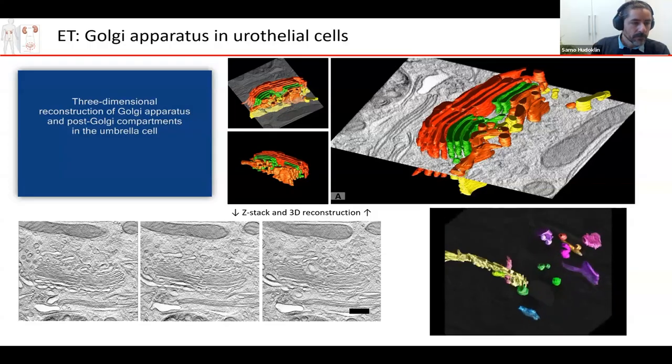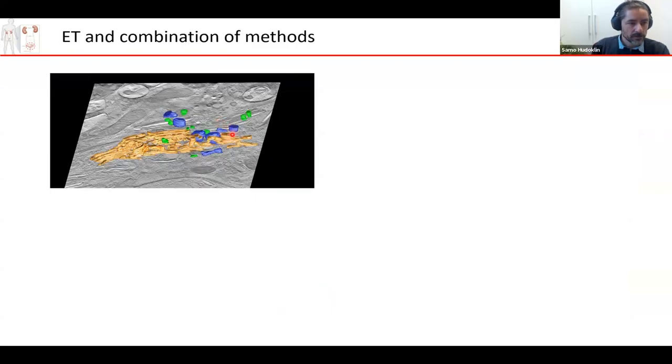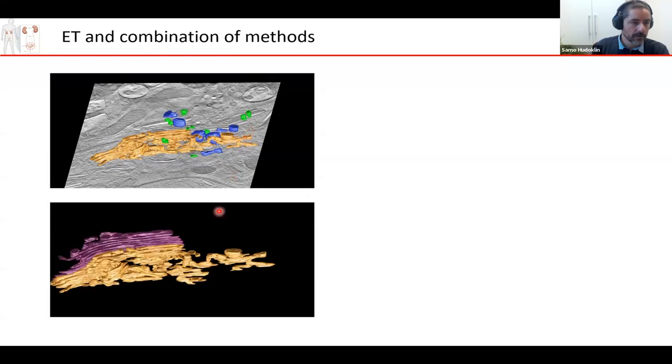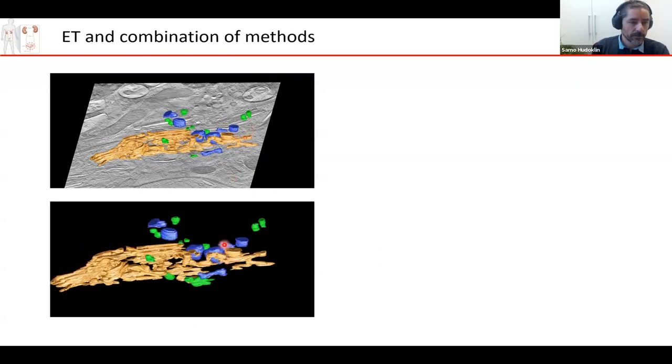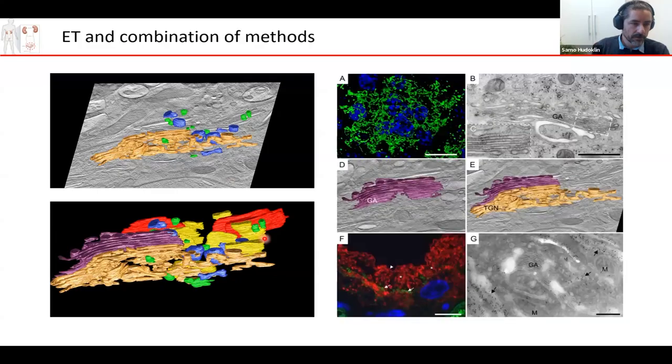What we've seen is that it's not the case that the fusiform vesicles mature just by detaching Golgi cisternae. We have individual compartments leaving the trans-Golgi network, and those smaller vesicles fuse together to form bigger structures, immature and then mature fusiform vesicles.